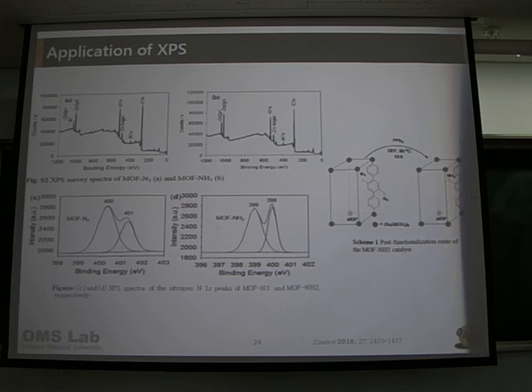그러니까 왼쪽에 있는 것도 399랑 398에 대한 에너지를 포함해서 그려야 되는데, 저 그래프만 봐서는 원래 399, 398에서 나오는 픽이 왼쪽에서는 거의 없어졌으니까 없애고 400이랑 401만 한 것 같은데, 그 100% 같다는 거.